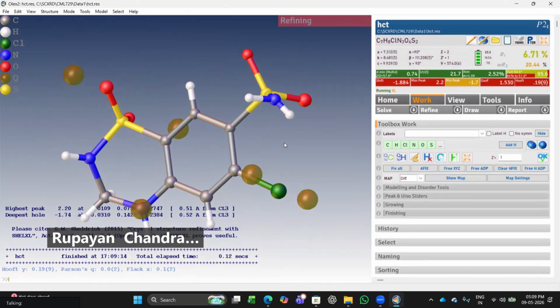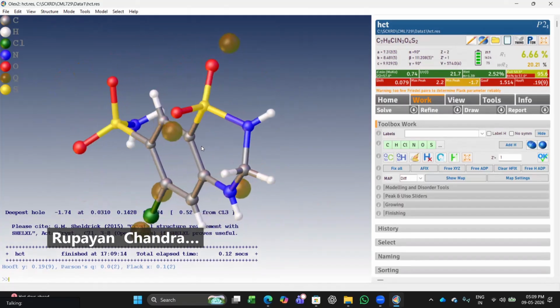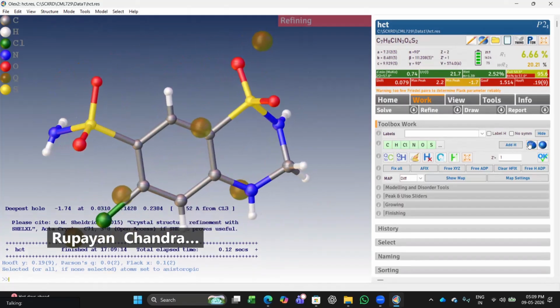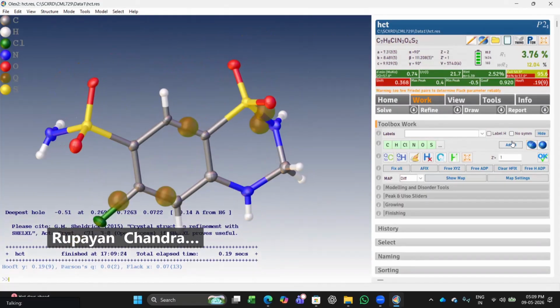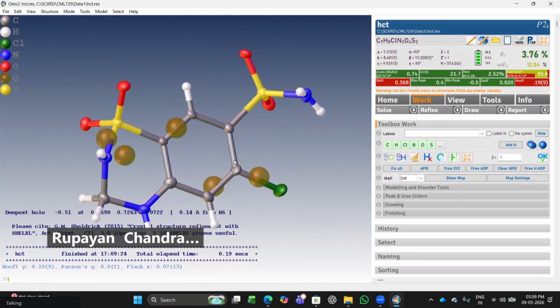Now we can say we almost solved our structure, but here we have to notice that these boxes should be green, not red. So we need to do anisotropic refinement. Due to thermal vibrations within the material, the effective volume of the atom appears larger. That's why electron densities cannot be shaped as spherical here. Such thermal motion in atoms is known as the Debye-Waller factor.